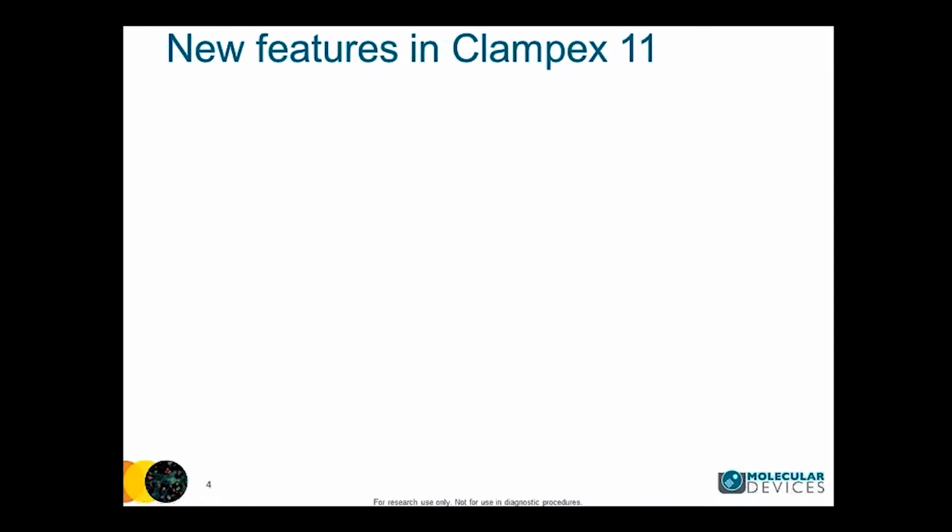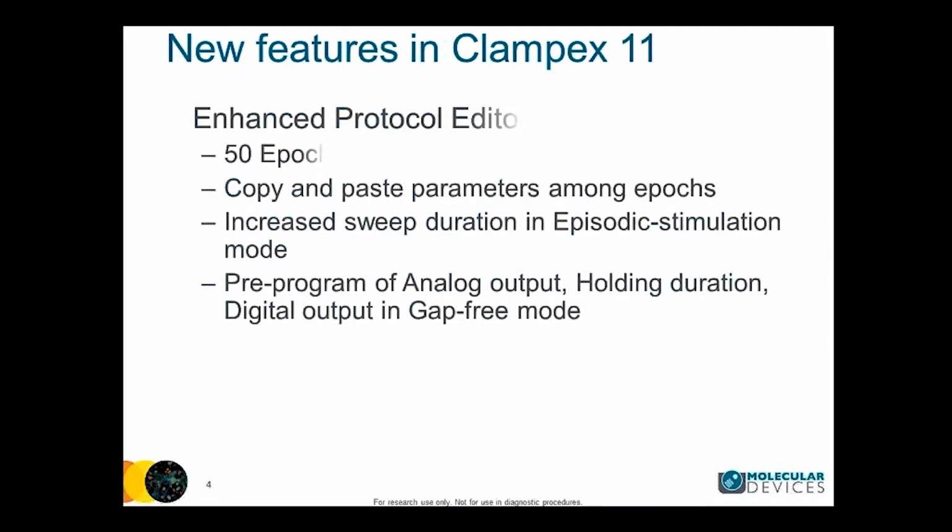Now, this slide shows you the new features in Clampex 11. I'm not going to talk about this in detail, since this is only a slide about Clampex 11. In order to increase protocol generation flexibility, we have enhanced the protocol editor, in which we increase the number of epochs to 50.